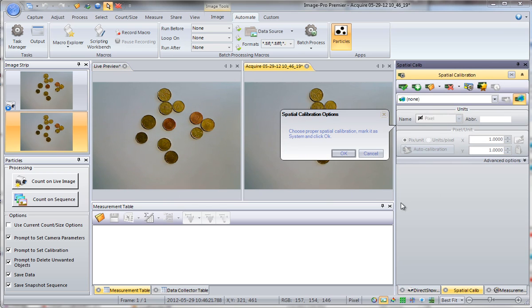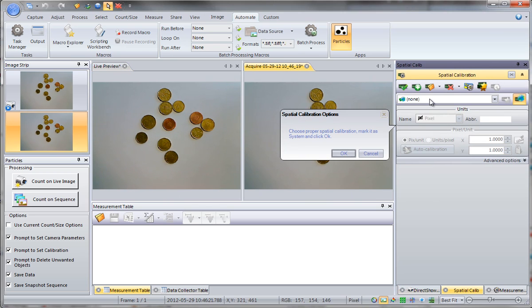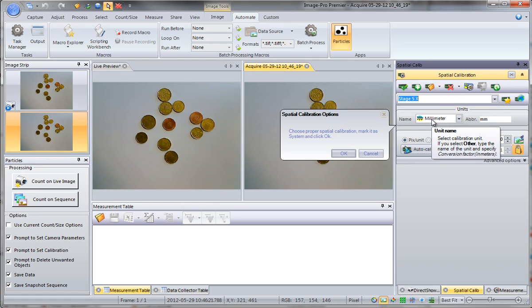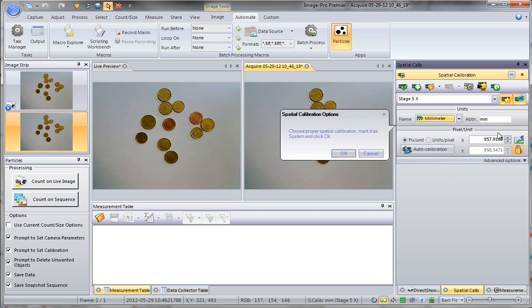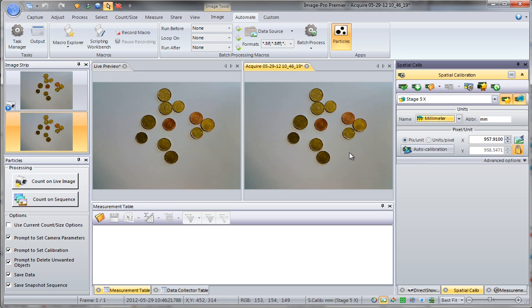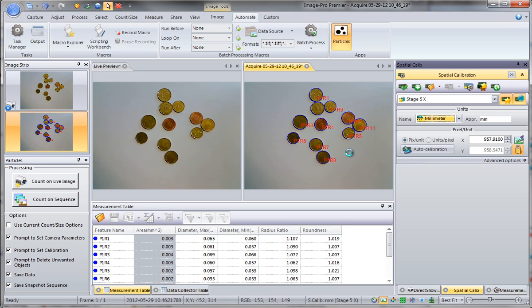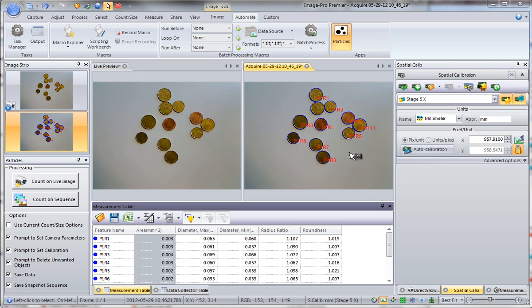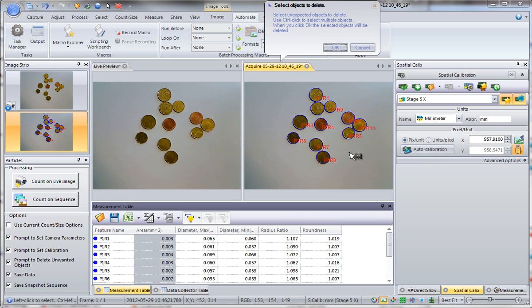The image is captured and you are prompted to set proper spatial calibration. You can apply and set this calibration as system, so all new images will use this calibration. Click OK. The image gets captured and objects are separated.